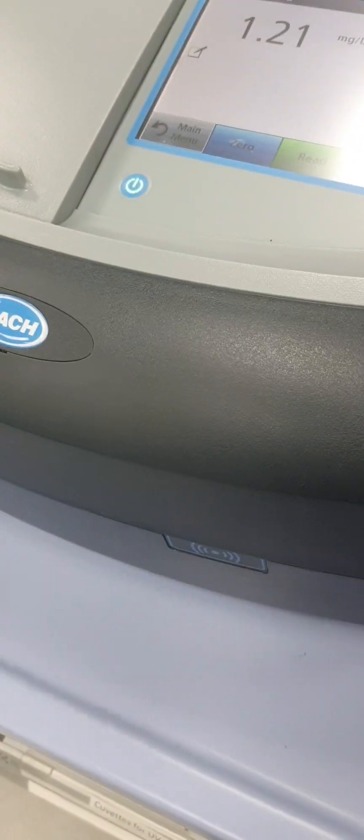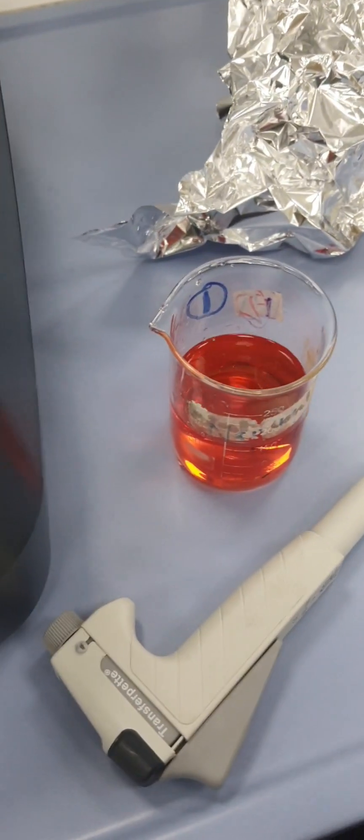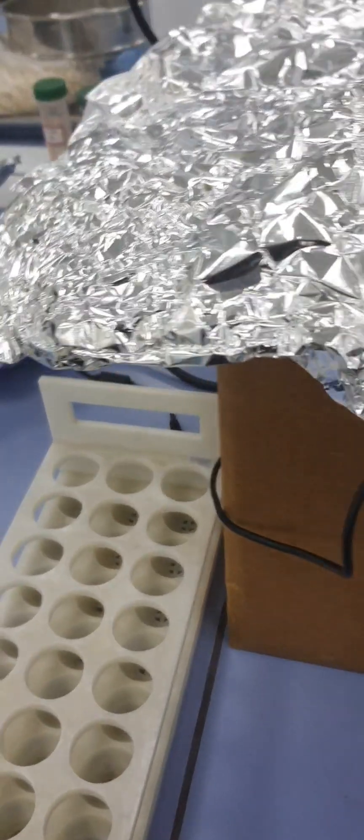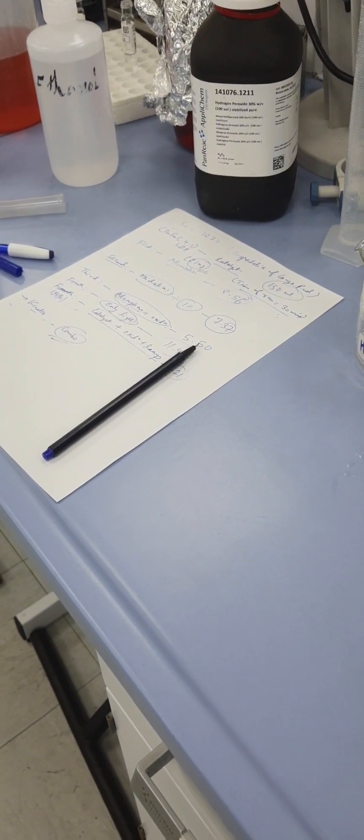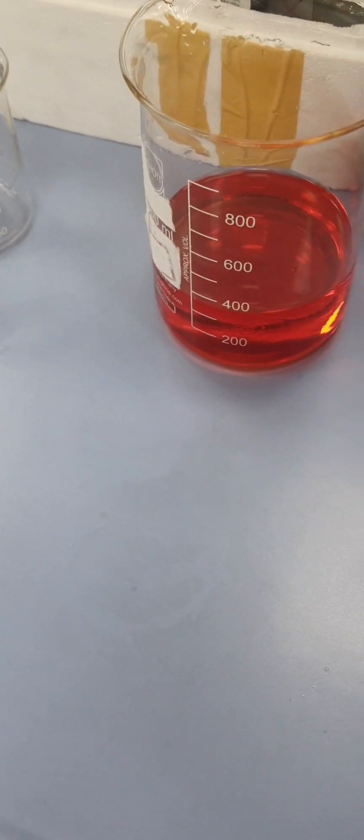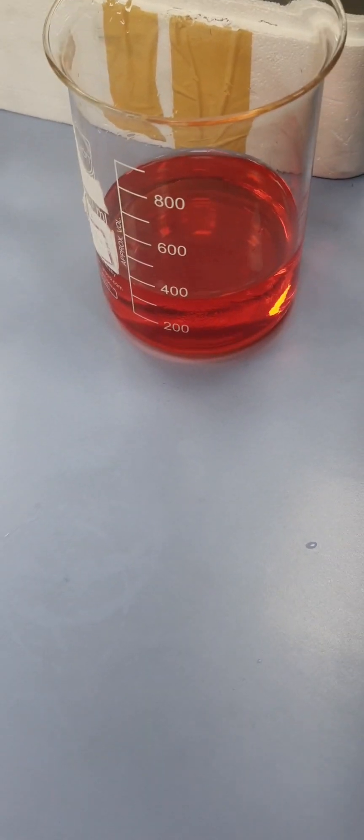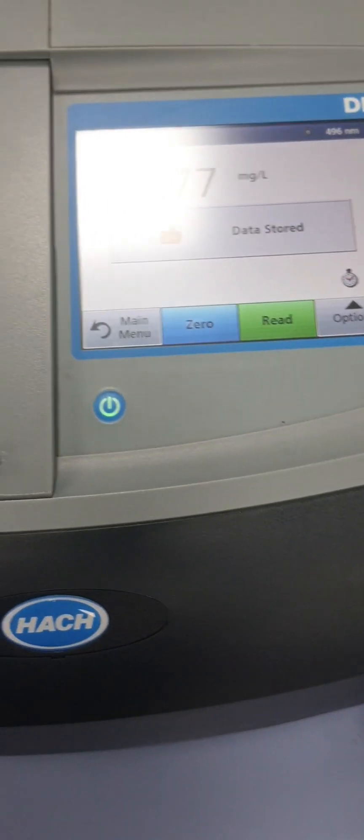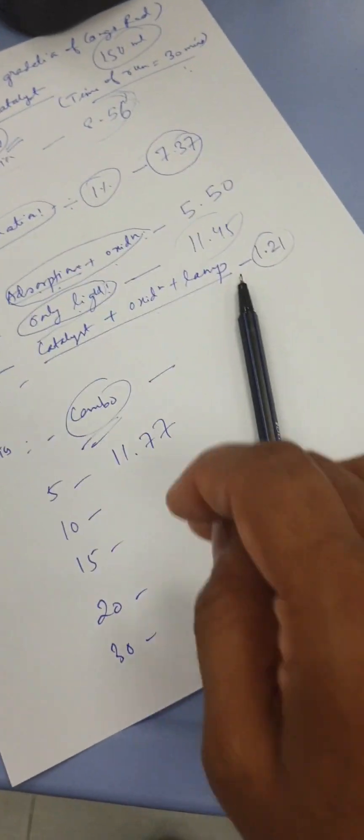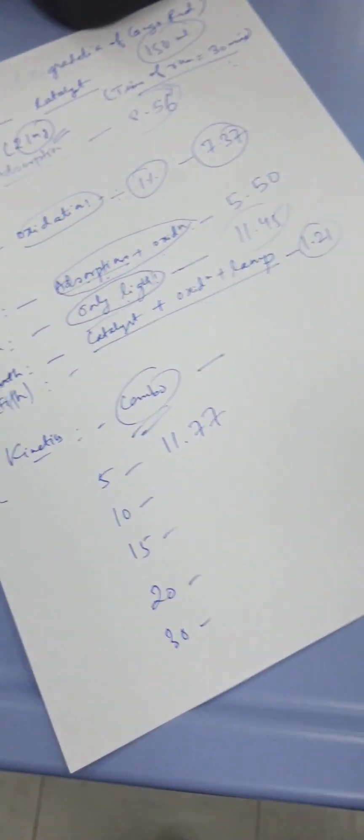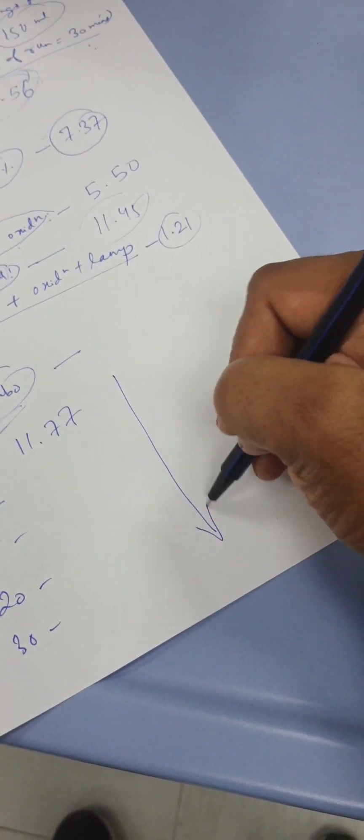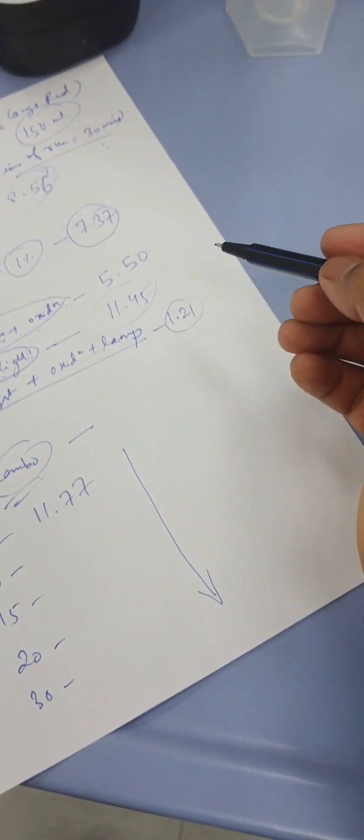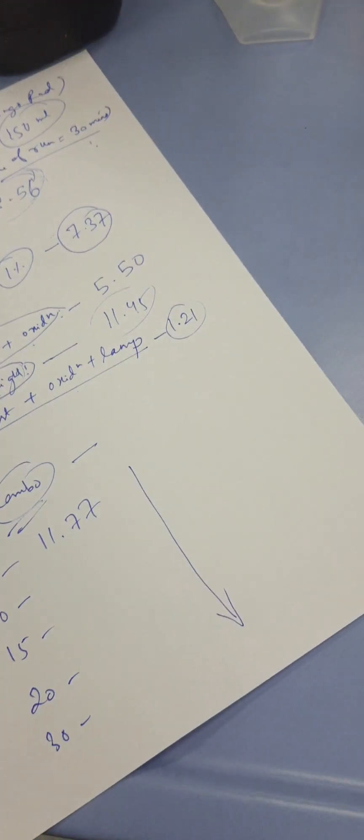Let's do the kinetics. Already we have transferred the sample. I just need to add a bead and start the process. We have covered our system for the kinetics part, and then we will start to take the sample after every five minutes. We have the sample for the first five minutes - it shows around 11.77. Now after ten minutes, five minutes again we will check. Let's see where we get around 1.21 or you can say the best degradation.